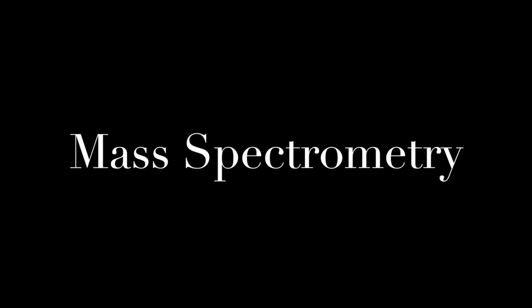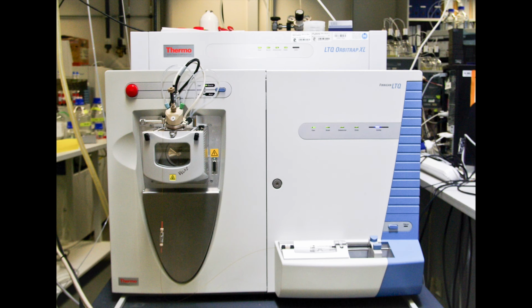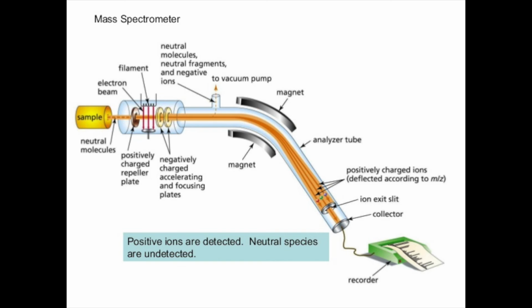Mass spectrometry is a technique that ionizes chemical specimens and sorts the ions based upon their mass-to-charge ratio. More simply, a mass spectrum measures the masses within a sample. Mass spectrometry is used in many different fields and is applied to pure samples as well as complex mixtures.